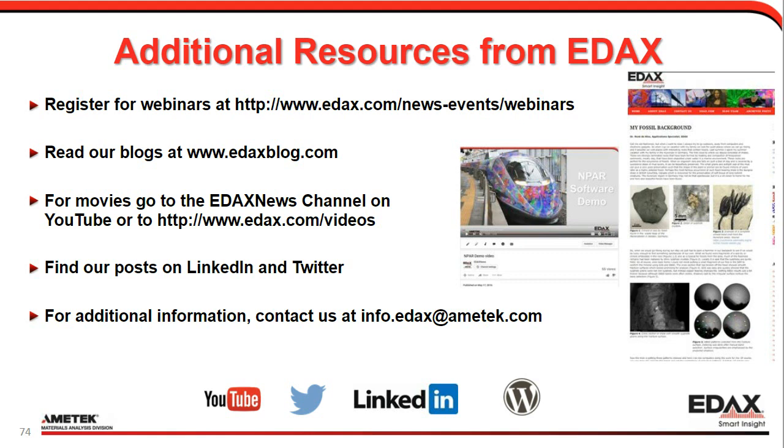I feel bad that I meant to include the slide from our paper, and I'll try to put that in a future release where it's pretty easy to find. NLPAR is a lot slower. That is in the paper. Sorry, I didn't include that. I thought I had the paper handy, but I don't. So I'll have to send you that information.